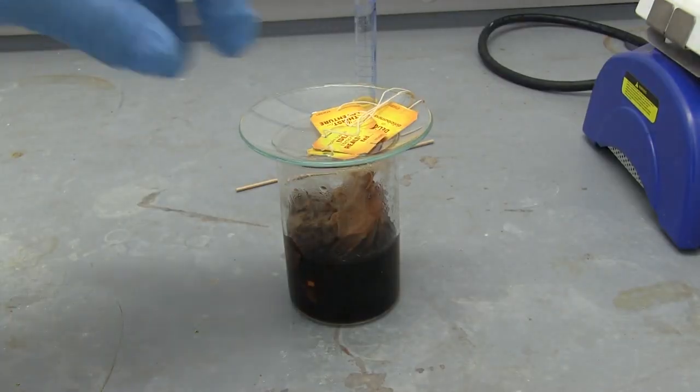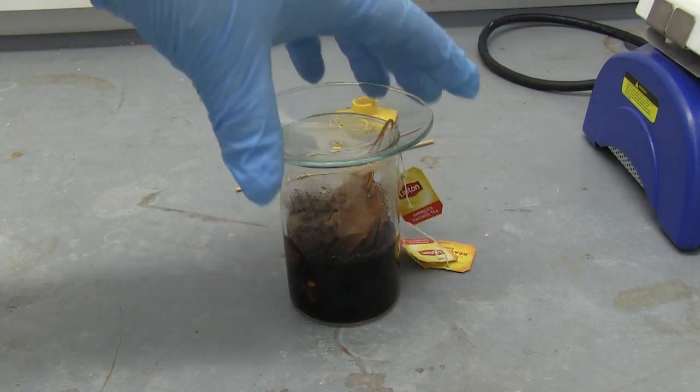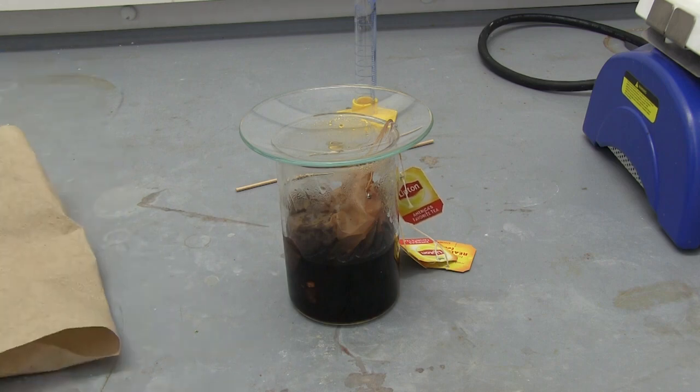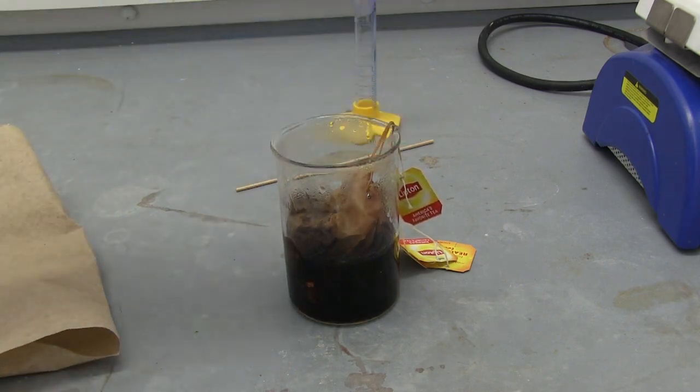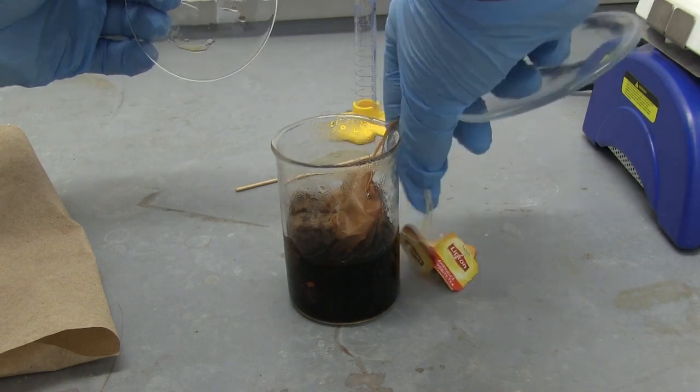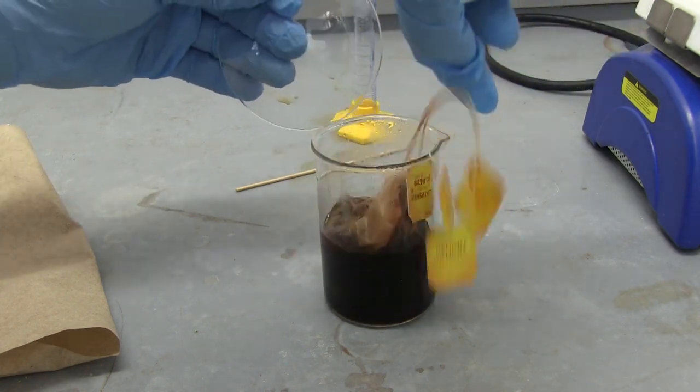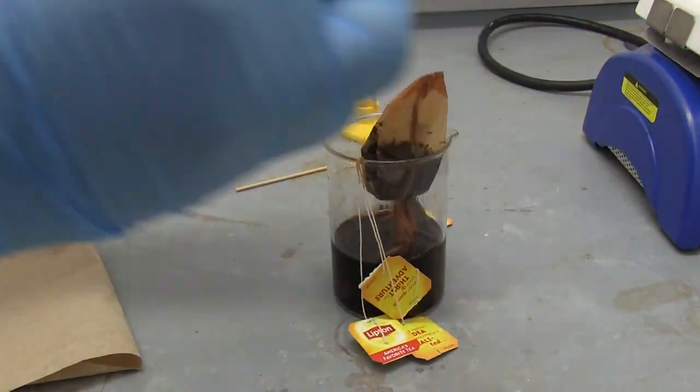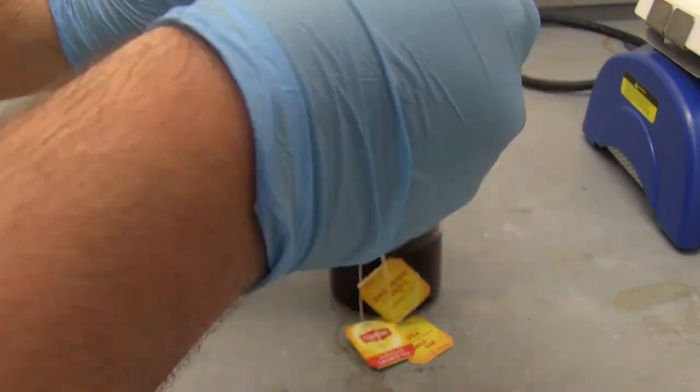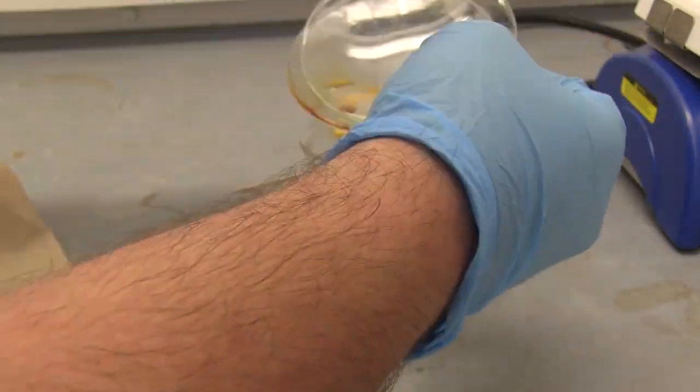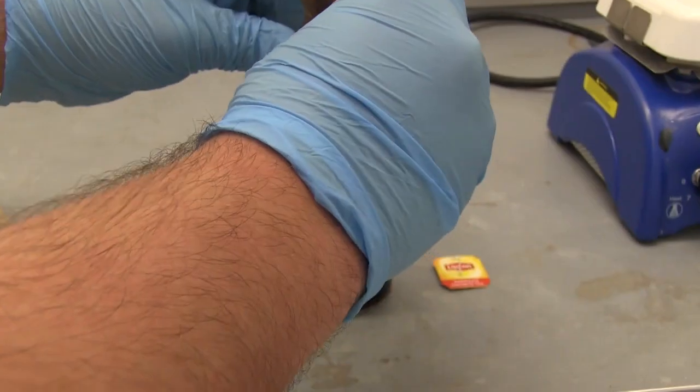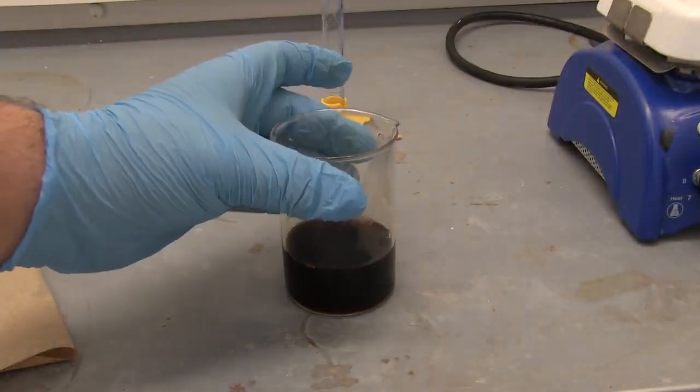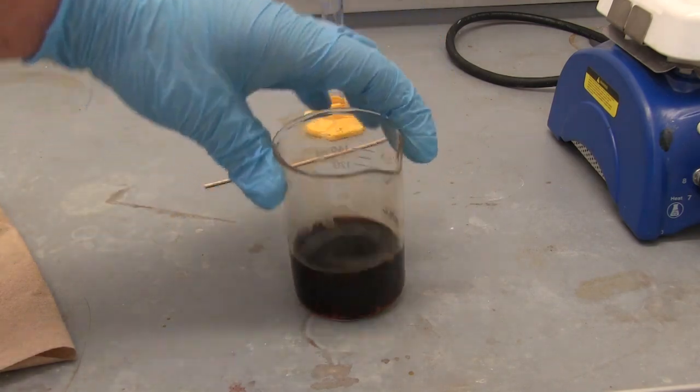Alright so now we have our tea. We're going to squeeze out our tea bags. I got some paper towels off the side and two watch glasses that we're going to squeeze the tea bags in between, probably just do one at a time. It's still really hot so I want to be careful. Now we're going to let this cool down to room temperature and I'll begin extracting it.